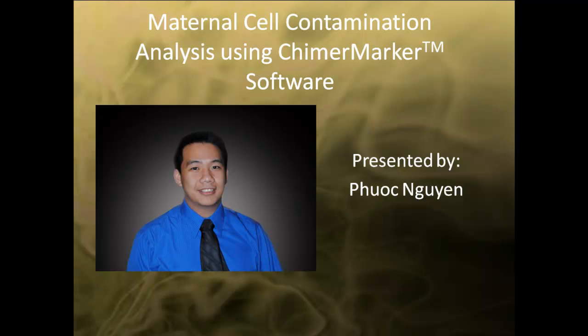Welcome to the Maternal Cell Contamination Analysis webinar using ChimerMarker Software. My name is Fu Kwen and I will be the presenter for this webinar.